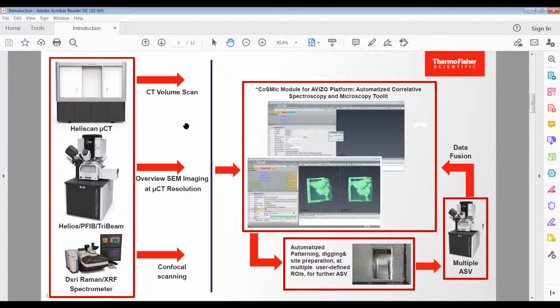And the user will be able to get in data from scanners and confocal spectrometers in specific models that we have already developed. We have mainly worked on the Raman, but we are extending it to X-ray fluorescence and diffraction as well.